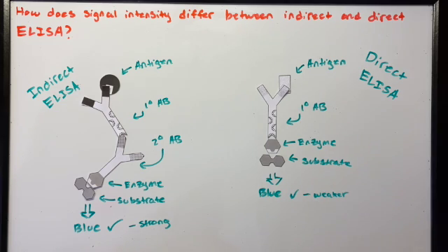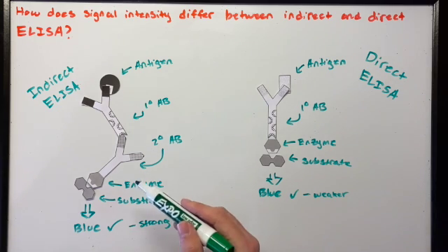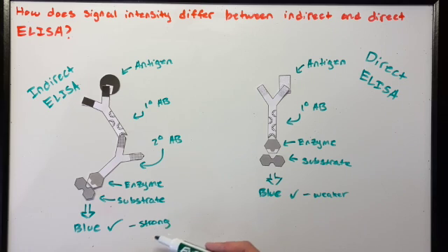The presence of the secondary antibody is very important because while they do not determine whether a color change occurs in the first place, they do aid the primary antibody by helping in detection, sorting, purification, and most importantly in this case, signal enhancement of the antigen. Because of this, the presence of the secondary antibody will determine the strength of the signal.